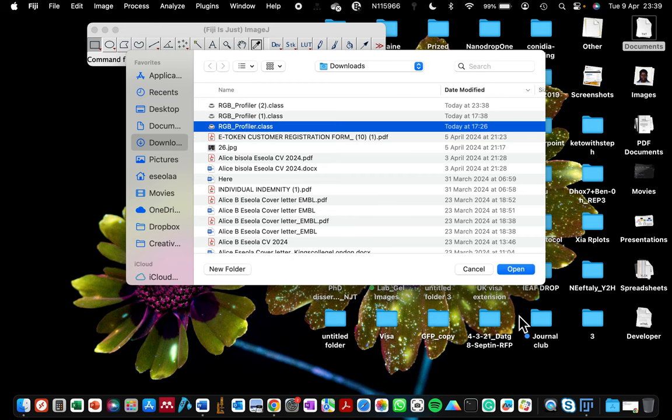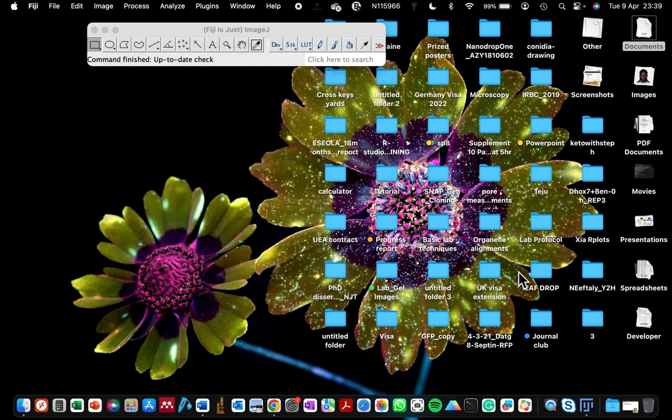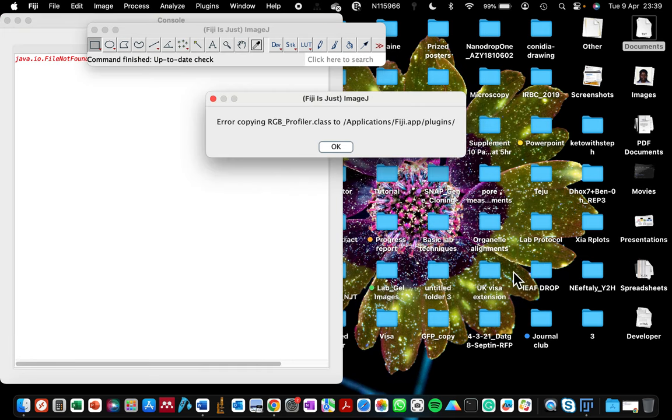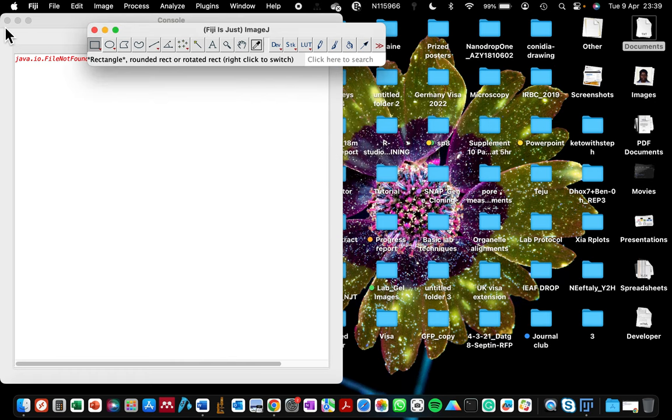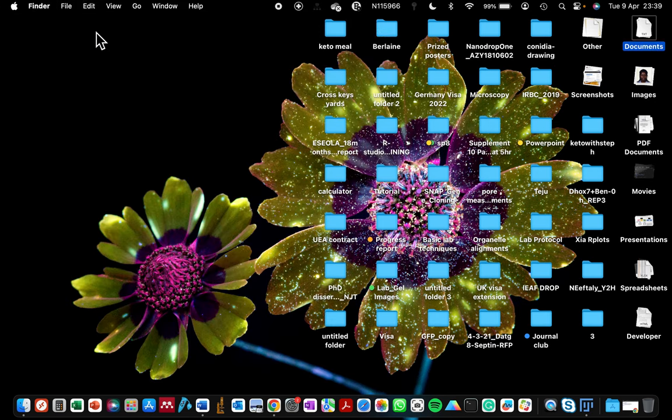As you can see, with Fiji it says error copying RGB profiler class to the location where it's supposed to plug it to load it in. That's one of the problems with Fiji. If you are experiencing this, don't worry, I'll show you how to go about it. I'm going to close my Fiji.